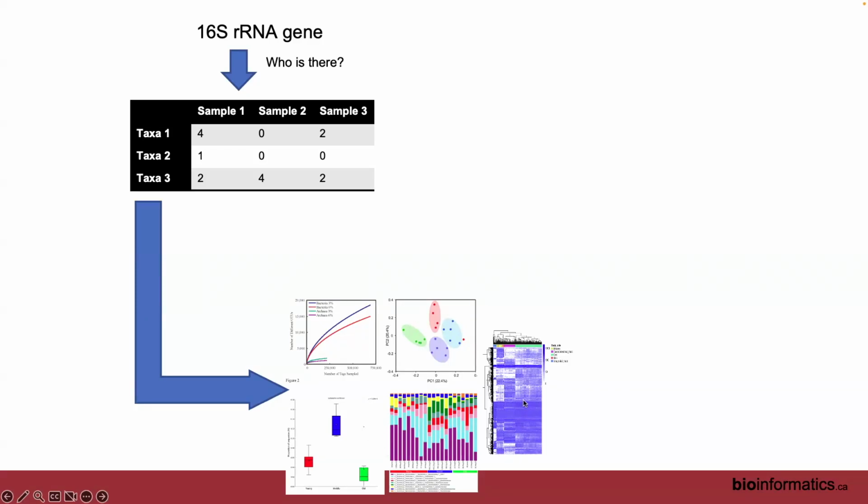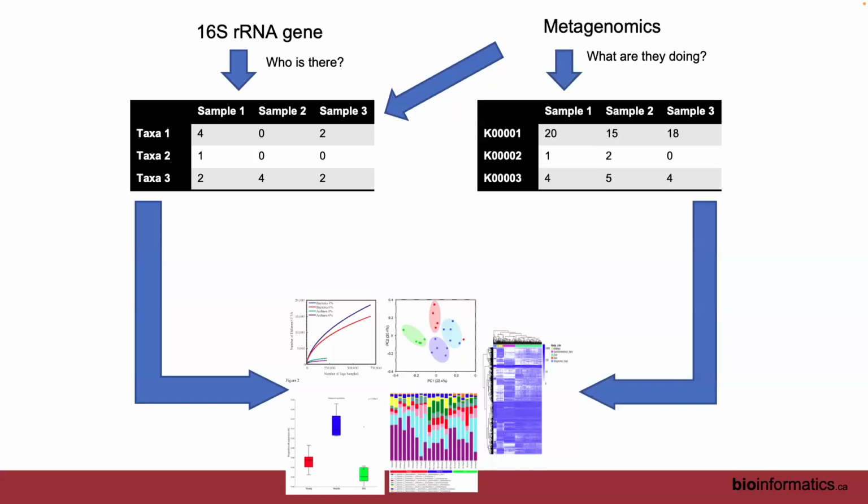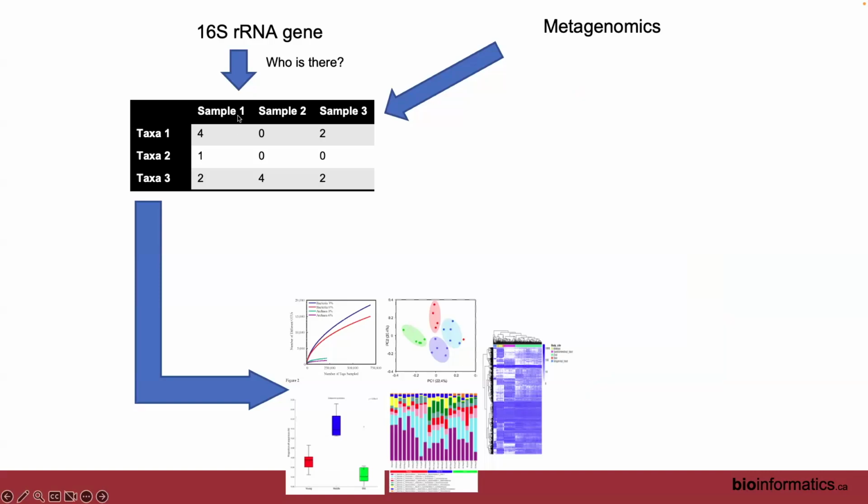So that's wonderful. And this workshop has been mostly focused on amplicon data, which is great. The advanced one is going to go into more metagenomics for those people that are sticking around. But metagenomics data will give you this taxonomic table as well, as we'll see on Thursday. And we can do some of the same things on that taxonomic table. There are some advantages there we'll talk about later. In theory, we get better resolution, more strain level things, all that fun stuff.